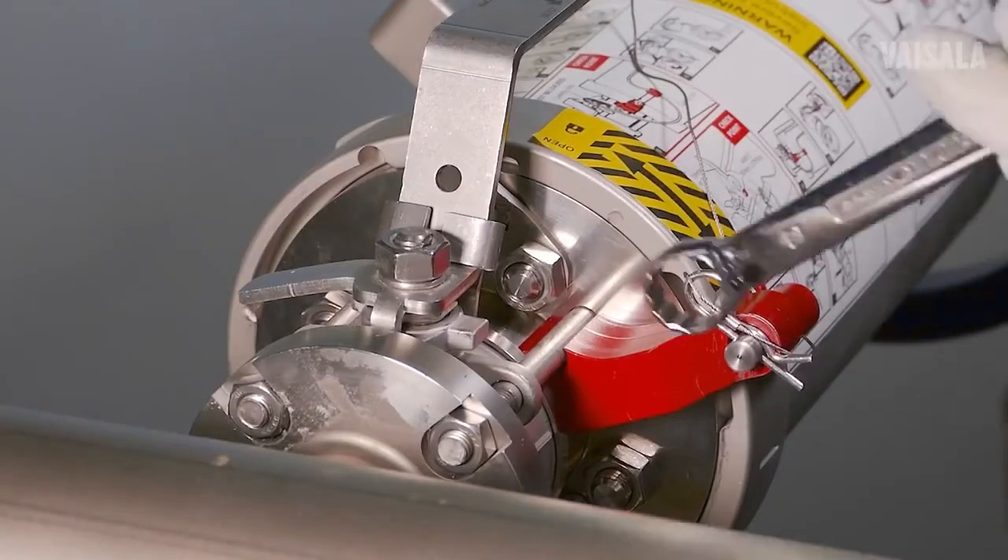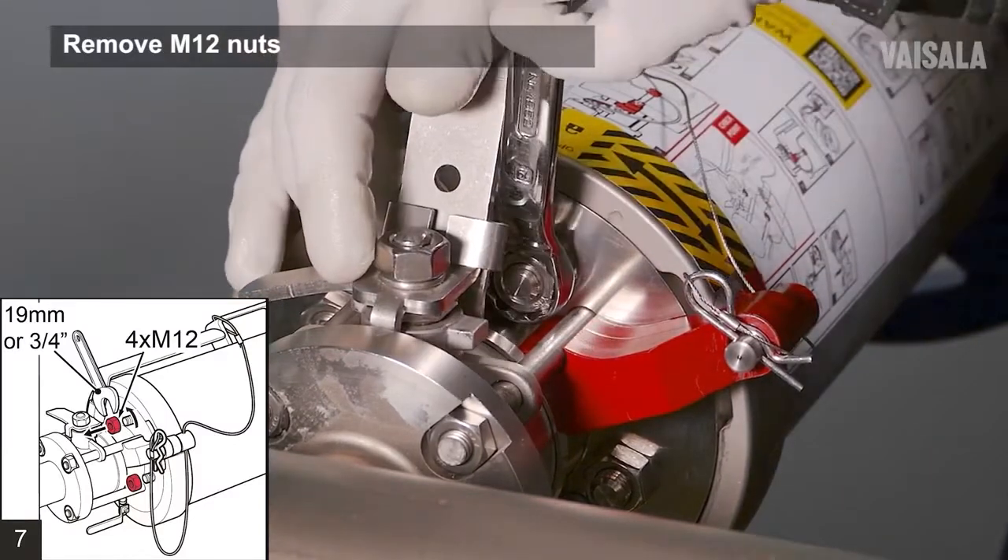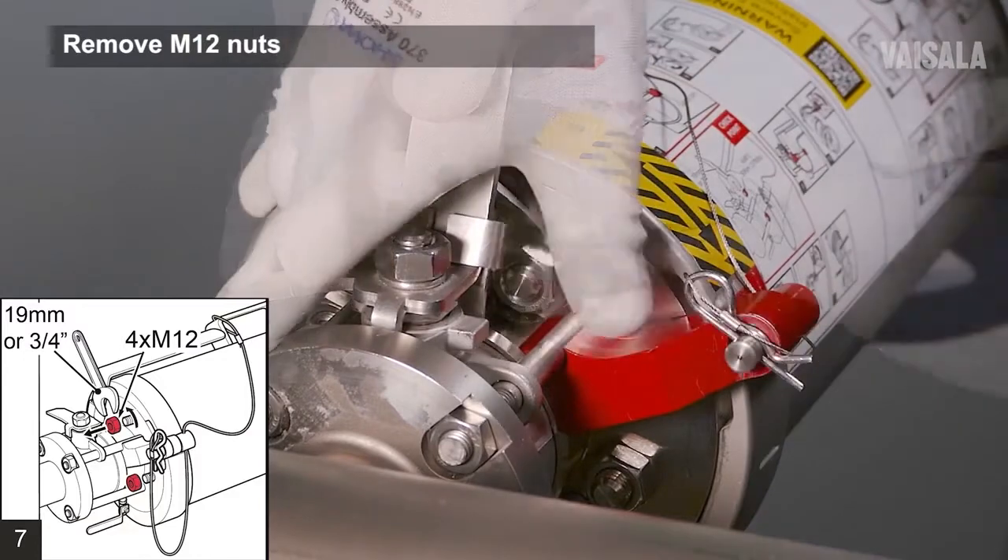Open and remove the four M12 nuts on the bolts holding the sensor to the isolation valve, using a 19mm or ¾ inch wrench.